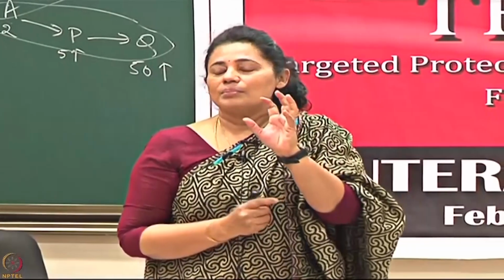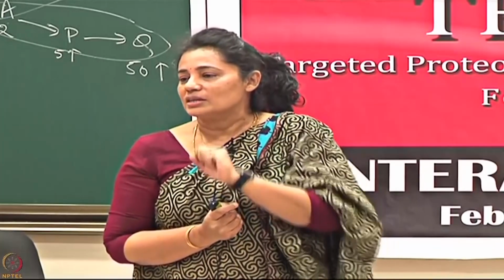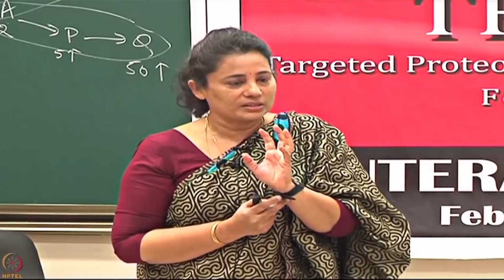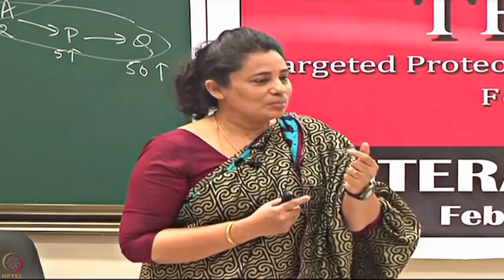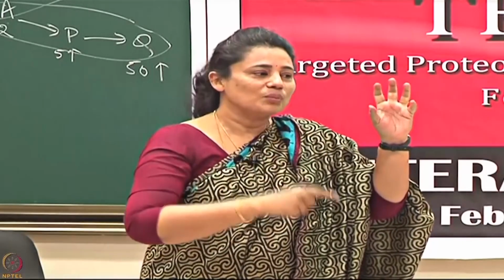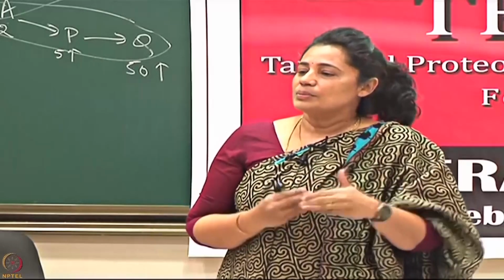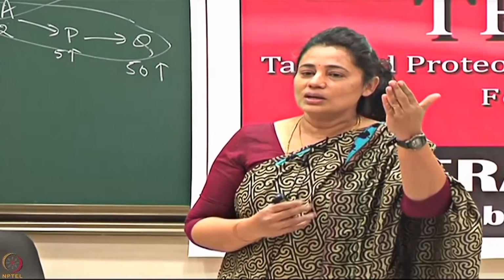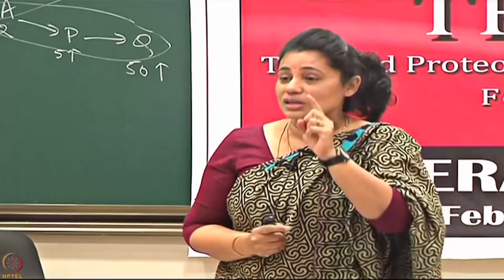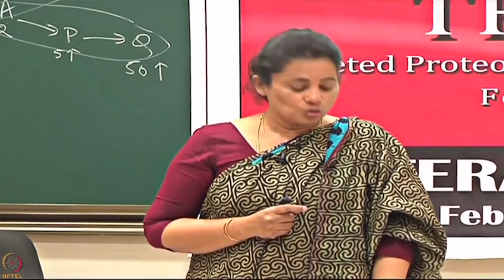And say, for example, I understood what is the residue that is contributing to this interaction among the EEVD, or maybe just these 3 residues are really, really important for interaction. I mutate it, I destabilize. So I destabilize not just a single interaction, I destabilize multiple interactions. Got the concept? So this is how you go from principles of domain mode of interaction to the network, and then you come to the reductionist approach of destabilizing the network using the very same principles. That's what we had employed in our study to look at gankyrin.